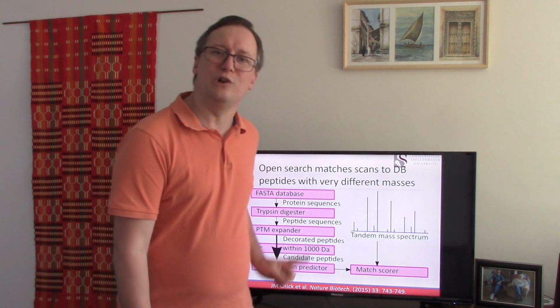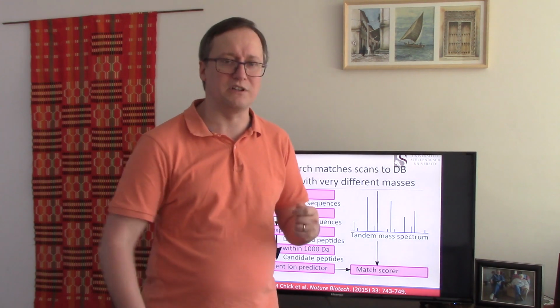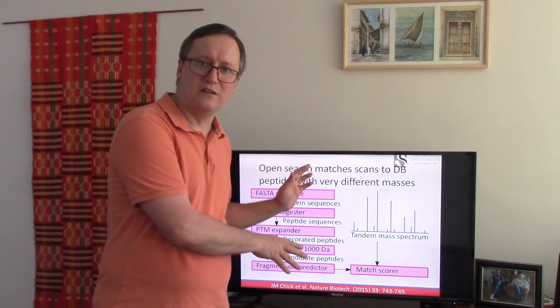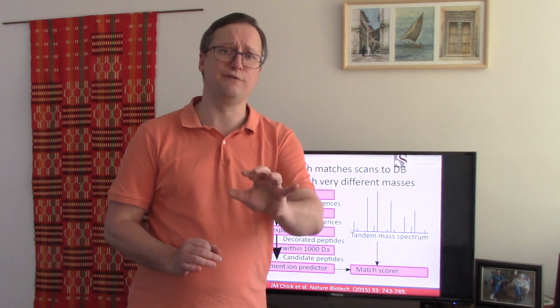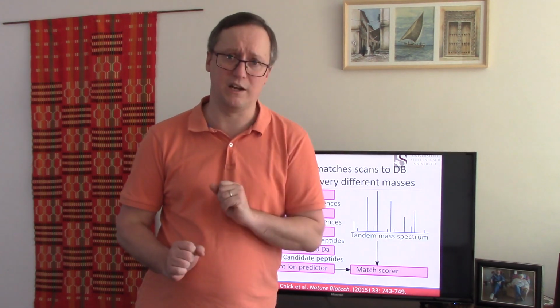As a result, we no longer need to rely upon the precursor mass being highly accurate to limit the number of peptides overall to be compared to the spectrum. So in a large way, this isn't just a bioinformatics innovation. This bioinformatics innovation depends upon the high discrimination afforded by highly accurate measurements of mass for fragment ions.